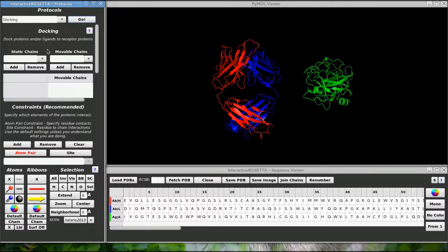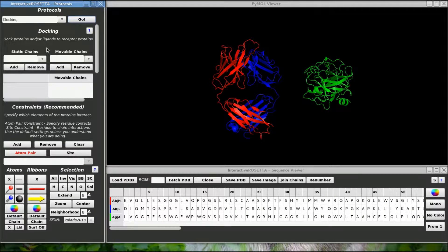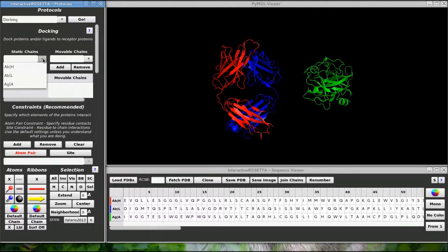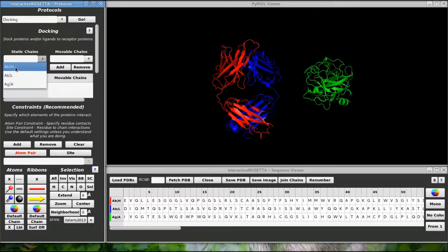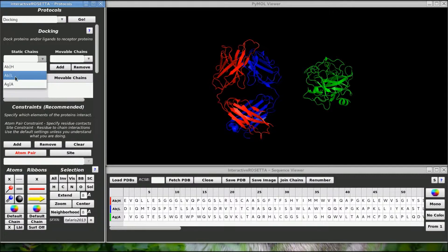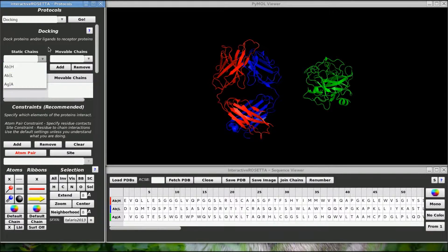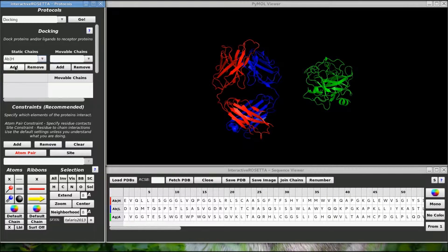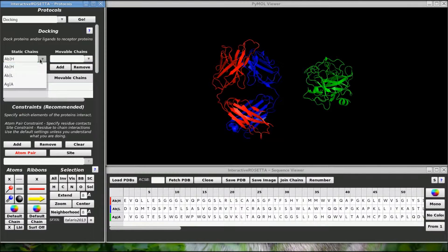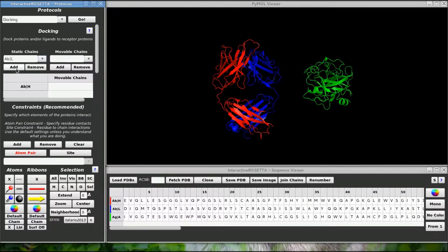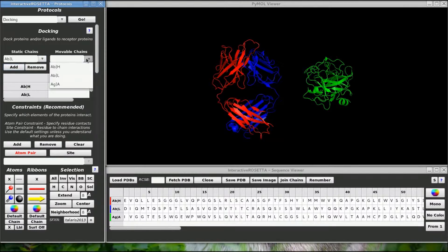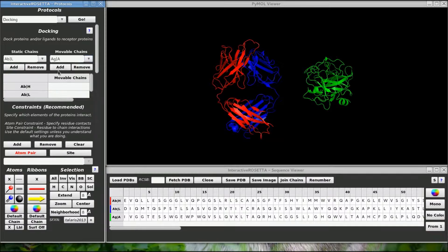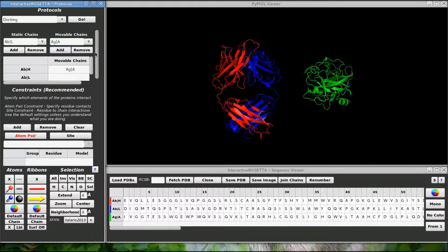Before I do anything else I have to tell Rosetta which chains will be docked and what groups they are in. The static group is the group of chains that will be fixed and the moving group is the group of chains that will be moved into contact with the static group. You can select chains from these drop-down menus, so let's put the antibody chains in the static group and the antigen chain in the moving group.